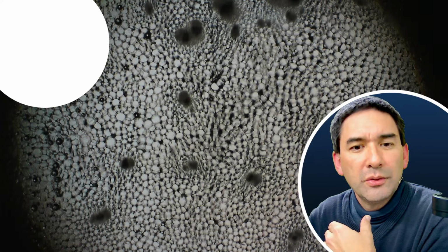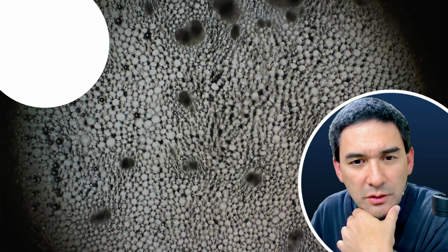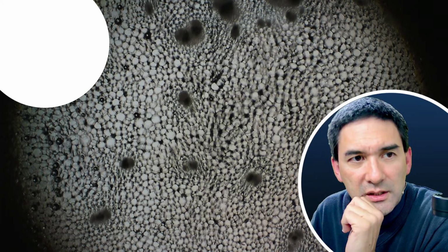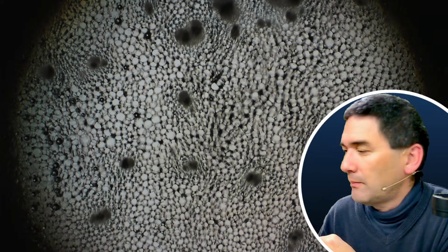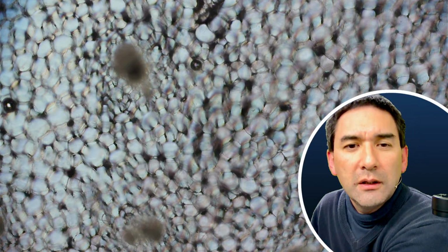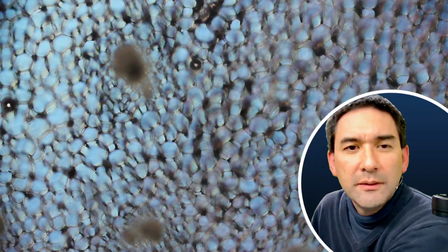Does this work or not? Unfortunately, I hope that I'm able to get the stage camera to work as well, but it doesn't. All you see is this white circle. Okay, so this is now the 4 times objective, and let's go up a little bit. This is now the 10 times objective, and generally I have to tell you, I'm kind of happy with this.